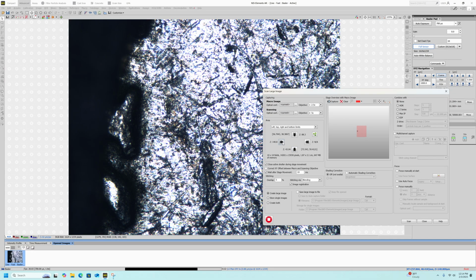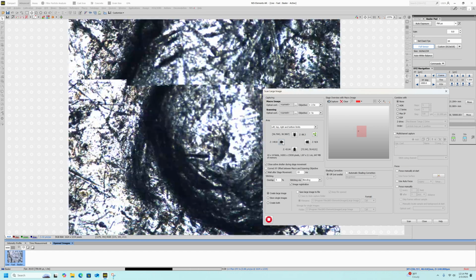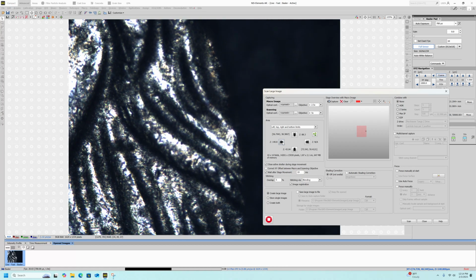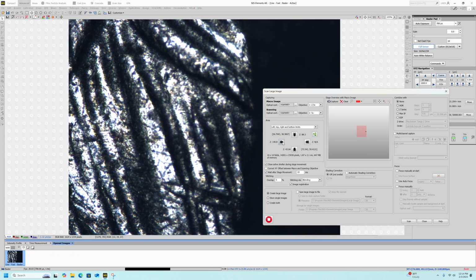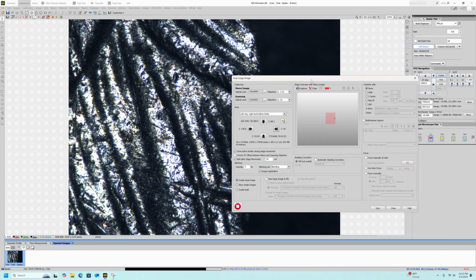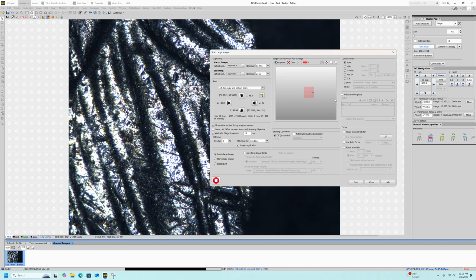And I'm just left clicking these buttons here to enter these positions in as desired. So with each left click that you do on each of these 4 positions, you'll see this box change and resize. So this little arrow here shows you where you are in the projected image stitch pattern.